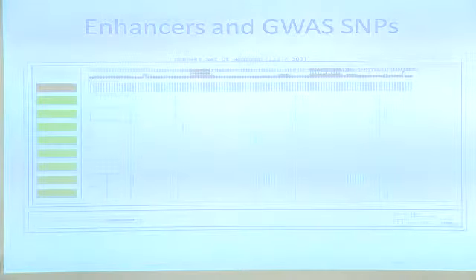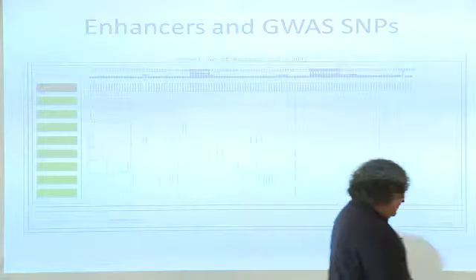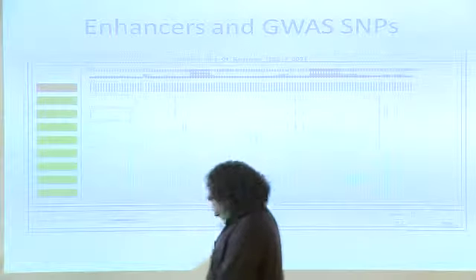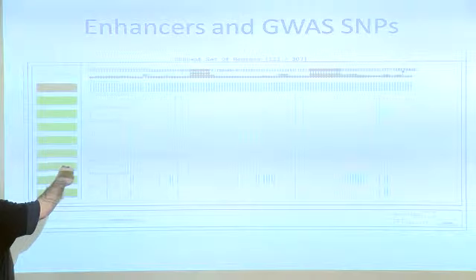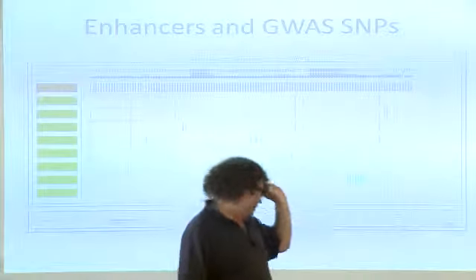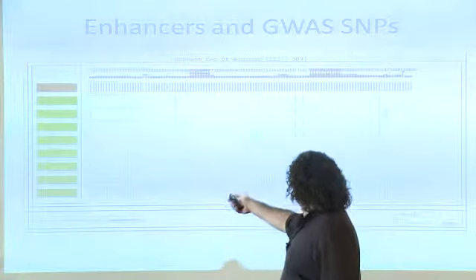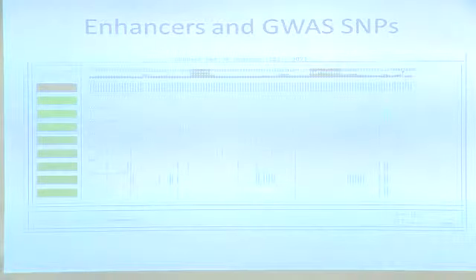An interesting thing to see here is that we're not just looking at these enhancers. I'm now going back to that question of the GWAS, right? We said that GWAS SNPs, you remember those mutations that are associated with disease, sometimes fall far away from genes, and we don't know what they do. So this particular list was further filtered down to be just around SNPs. Each column here is actually a little region around a mutation, a SNP that was found significant in its association with a certain disease. And this is all the GWAS studies combined, so many diseases are shown on this track, okay? And then we filter down from all those, only those that occurred in enhancers. And you see that quite a few of them do fall in enhancers.